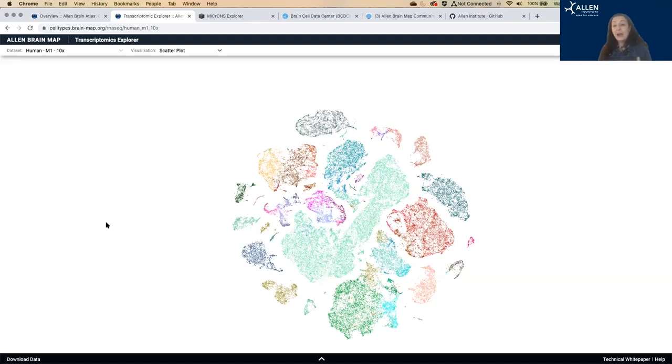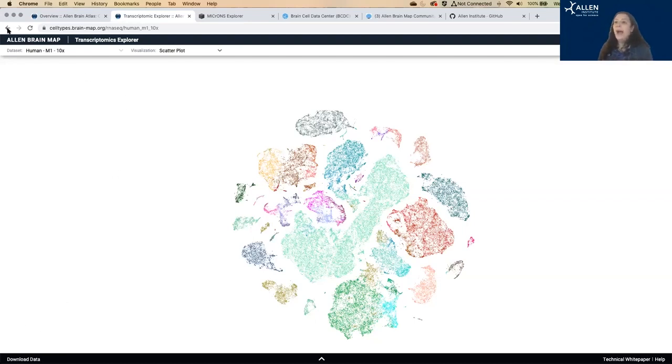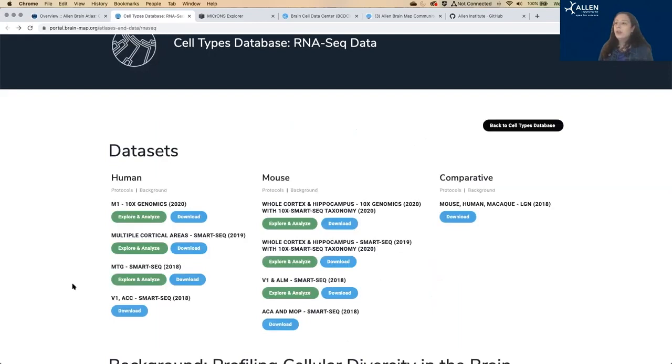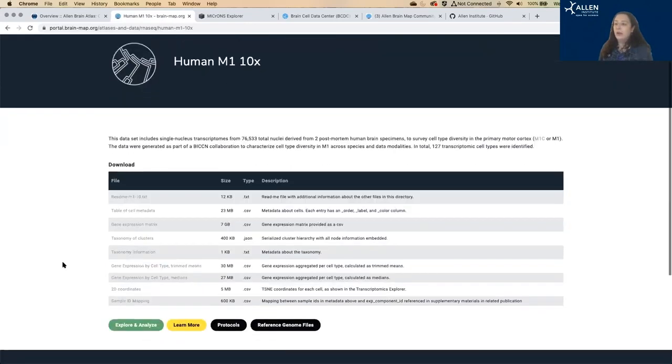But you can download all of the data from here, download data down in the lower corner. Or if you go back to this homepage here, we have information on how to download.